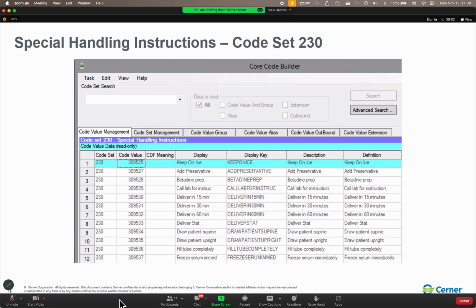We can actually create transfer temperature specific transfer lists. And Stephen, I see that you're saying this is an eye-opener. Oh yeah. There are so many interconnected moving parts and pieces to specimen management that it's just going to blow your mind. Or at least it did me when I was first learning.